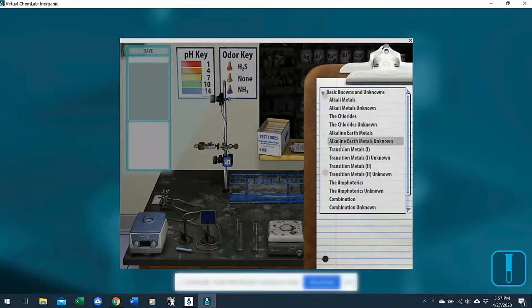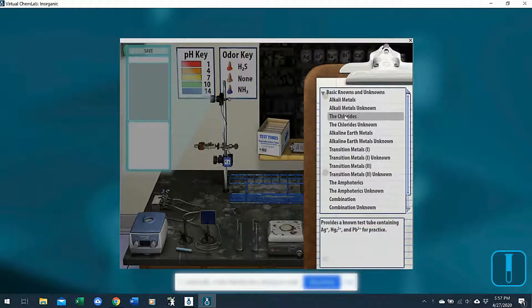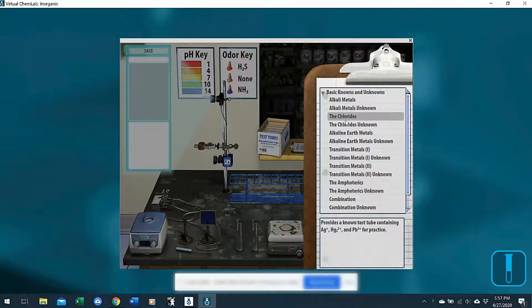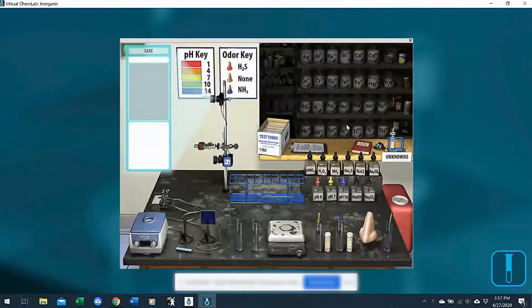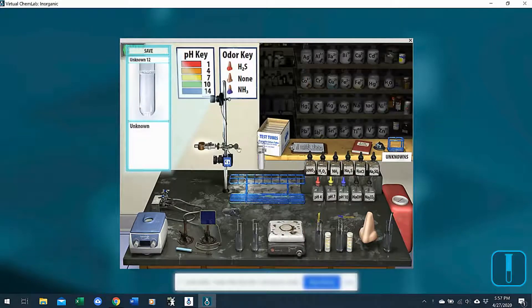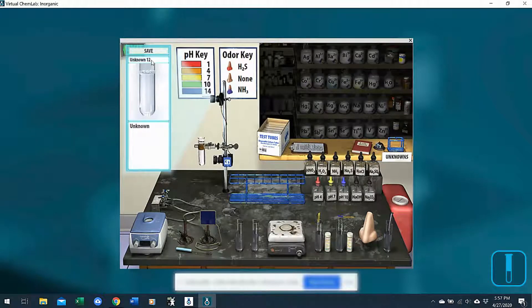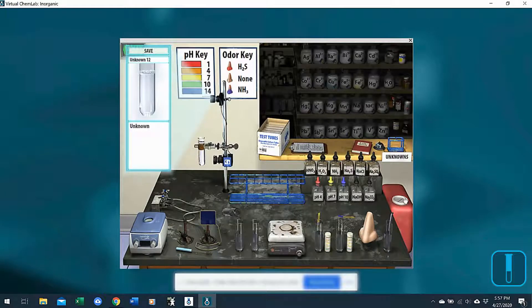With basic unknowns, you would tell your students — once you've taught them how to separate different types of cations — to choose one of the groups. It would then list at the bottom of the clipboard what the potential cations in that tube would be. If they click on the unknown, an unknown test tube is created. You can see there's a number at the top; you can look that up in your answer key and it tells you exactly what cations are in there. Students can do all the different tests and then report to you: 'I had this unknown number and this is what I think is in the tube.'